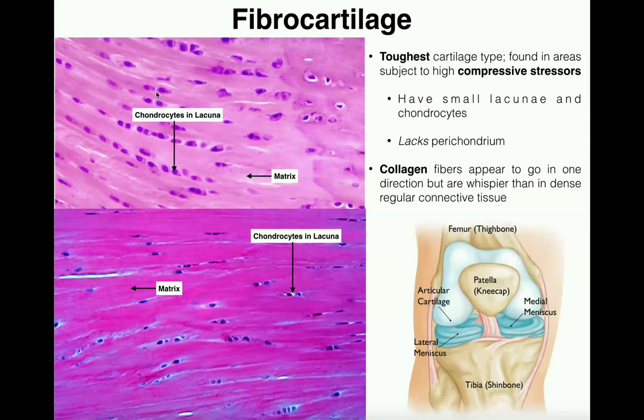If you notice, you can see that these fibers aren't really going in one general direction. It looks like they're kind of curving off to one side. So they're curving, not going exactly in one direction. That's a good bet that you have fibrocartilage and not dense regular connective tissue, because they're easily confused. If we look at this one, yes, there's a few going in one direction, but this one goes up, and then it's not going in one straight line, as you can see.